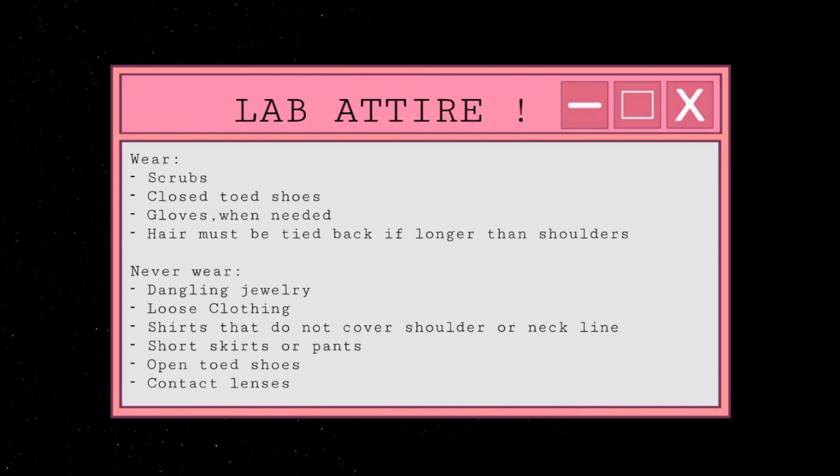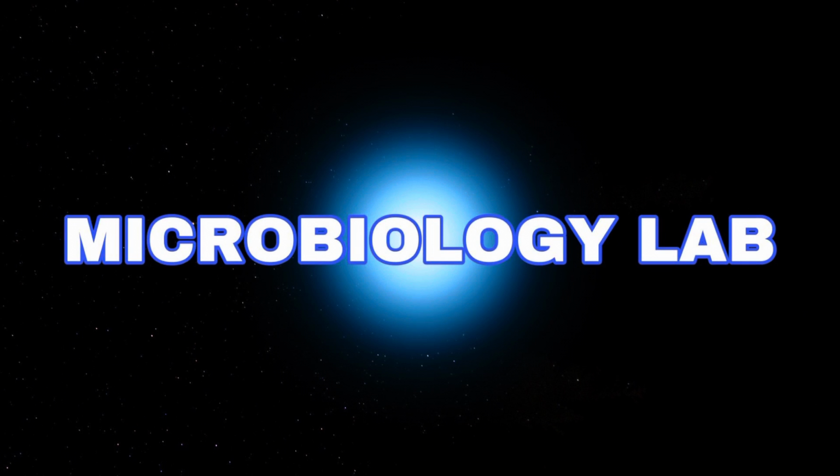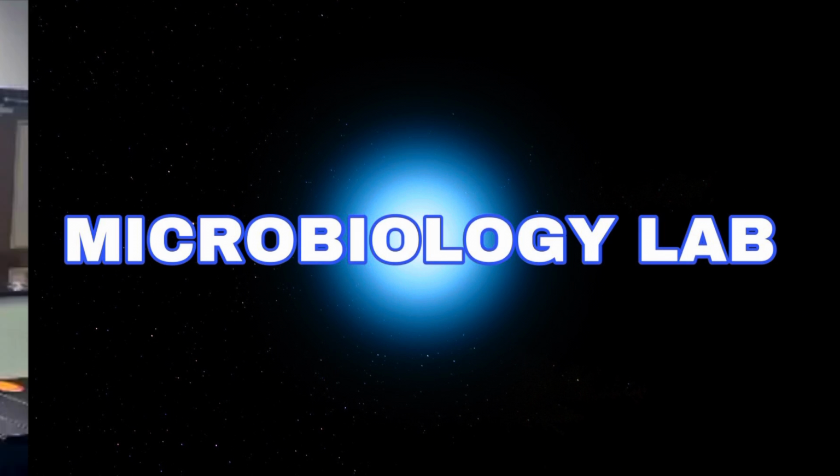Also, make sure you don't wear dangling jewelry, loose clothing, shirts that don't cover your shoulder or neckline, short skirts or pants, open-toed shoes, or contact lenses. This is all to ensure your safety in the lab. Now that we know about the correct lab attire, let's follow Dr. Jonathan and Dr. Terrence to the microbiology lab.